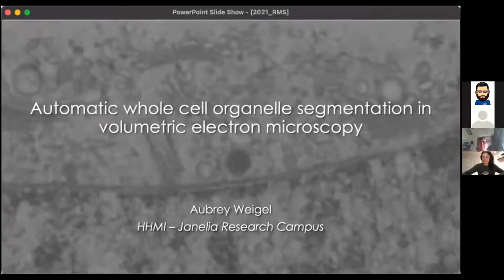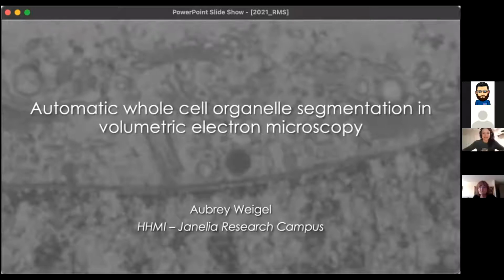Yes, thank you for the introduction. So I'll share this here. Can you see this okay? All right, so I will tell you about the work that I've been doing recently in automatically segmenting whole cell organelles in volumetric electron microscopy.